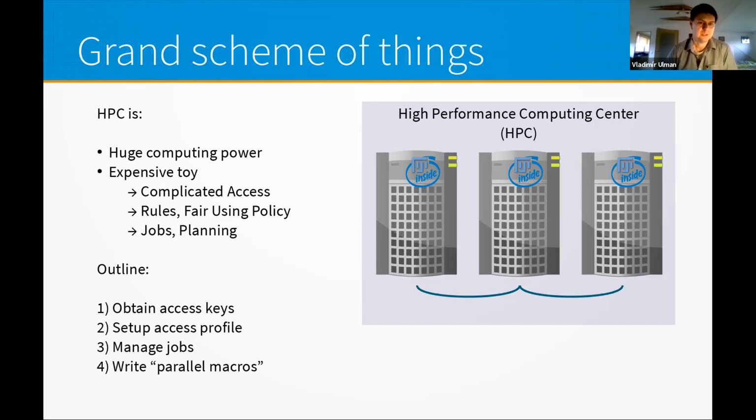So that's pretty much what we are up to now. We will now look into how to connect to the center, and then we will be inspecting the software that we have. We will show you how to start a job. We will explain what the job is and what its parameters are and so on. And then we will look into how to upload data, process the data, and how to get them back.